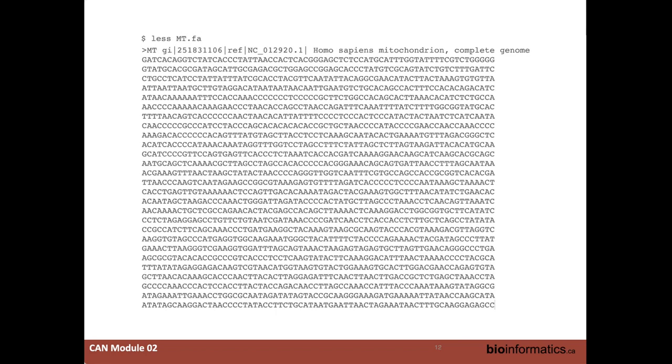Okay, so can anyone tell me what the sequence is for mitochondrial DNA for humans? Base by base. Can't remember how big it is, but if anyone can actually recite that by memory, I'm going to be really impressed. I can't do that. And luckily, we all have the capability of storing these things as files. And here is a FASTA file that has actual mitochondrial DNA in all its glory.